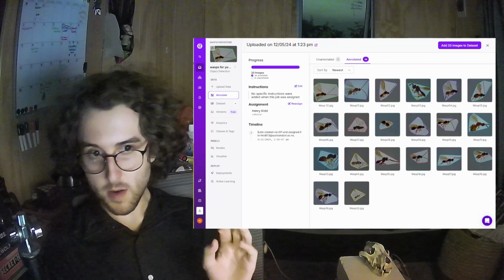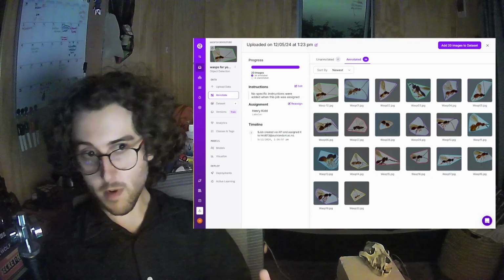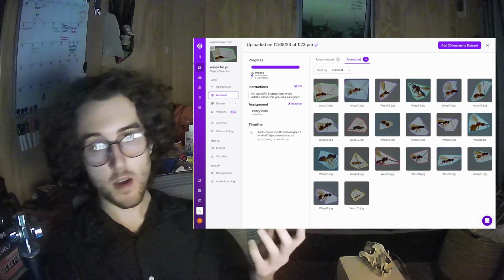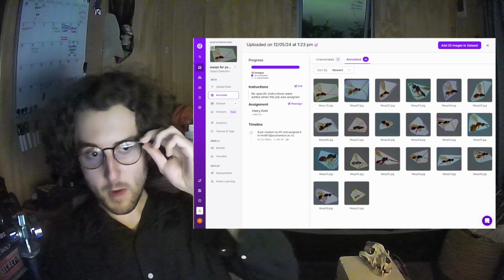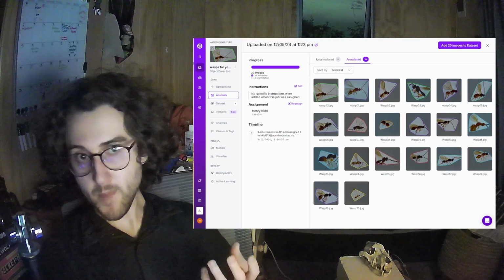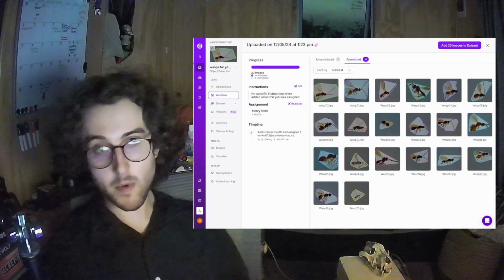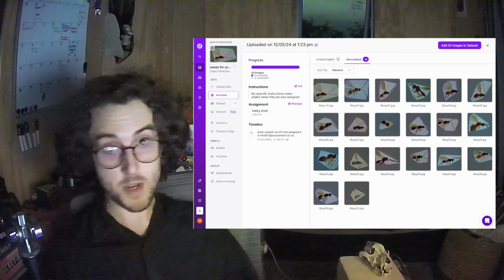Critical warning. Occasionally, when drawing polygons around diapriid wasps, you may find the time slipping away. You may find night overtaking the day, and you may find yourself beginning to fade. Or you may just end up with 20 labeled polygons of wasp. Amazing. We're done. We've succeeded.